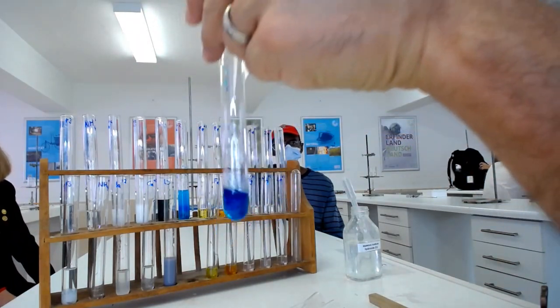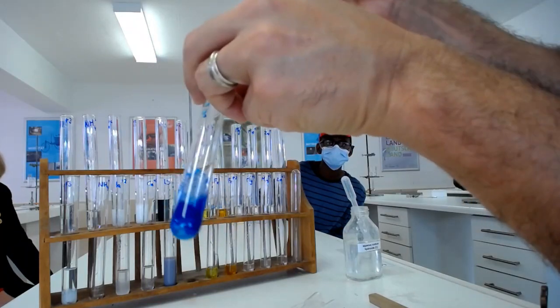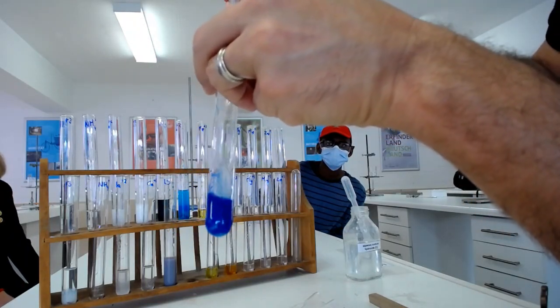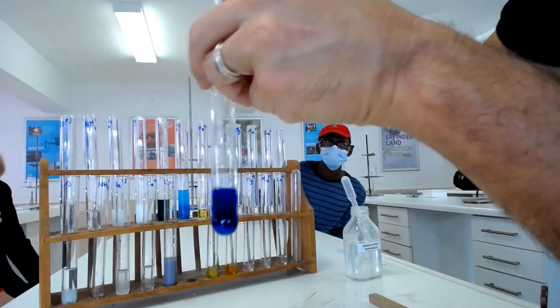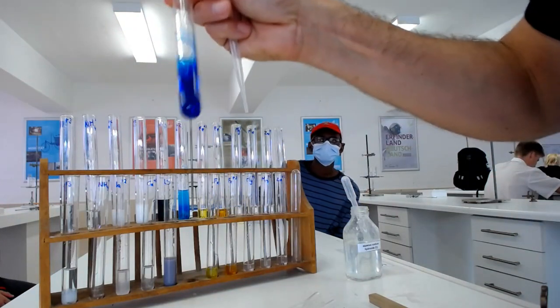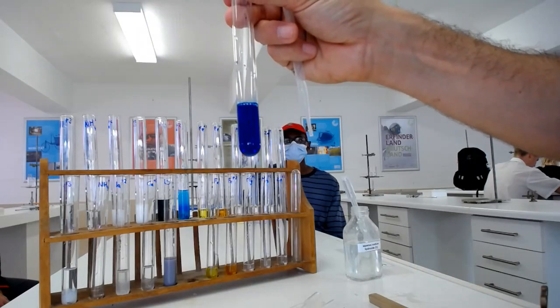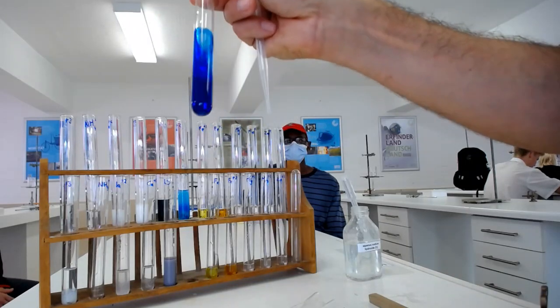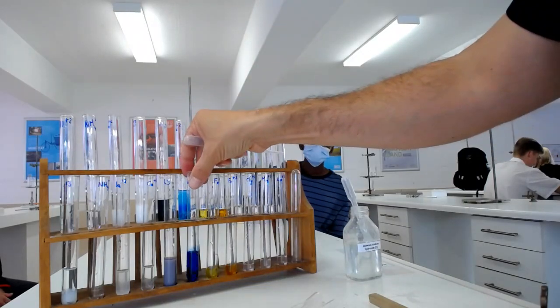Oh, look at that deep blue. Again, and if I add more, it becomes just a blue liquid. So it's first a deep blue precipitate, and then as I add more to excess, it becomes a blue solution. So it's soluble and it gives me a blue solution. So that's really important in your description.